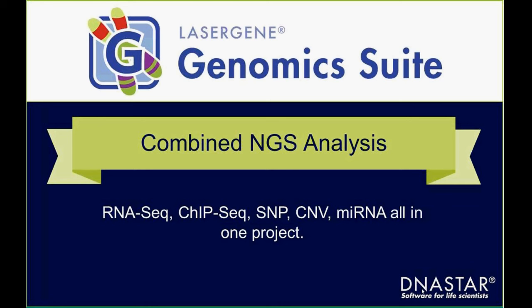And so we'll start today with some PowerPoint, and I'll introduce you to the company and some of the background for our NGS, and then we'll spend the majority of the webinar going through project setups and then some of the downstream analysis. And then, as Sharon mentioned, if you do have any questions, please chat them in, and I'll try to get to them as we proceed.